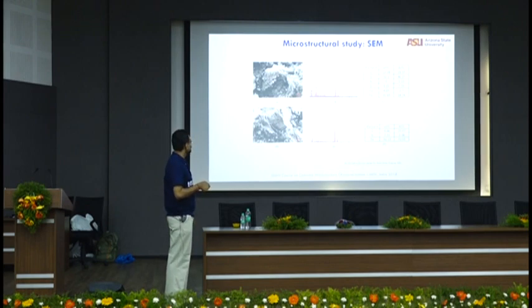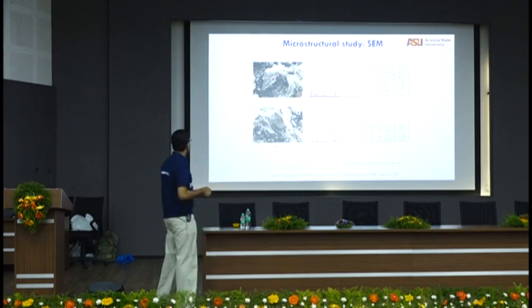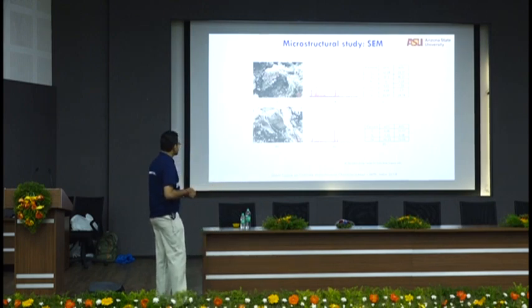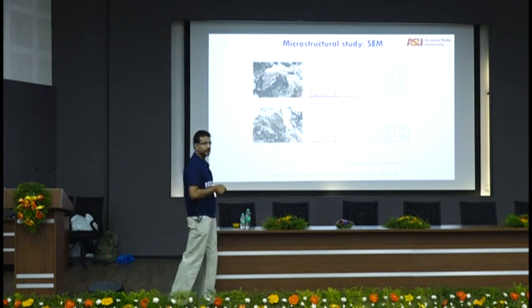So weight percent of carbon, oxygen, alumina, silica, calcium, iron. Carbon is because this was stuck on a carbon tape. So you have some carbon from that. And then that's a spot EDX. You see how different the value is. This is basically on an iron particle, and you see everything is iron. A little bit of silica, maybe some dissolved silica is there on the top of it. Very little, but you see mostly all peaks are iron peaks. And if you look at it, there's a little bit of silica, very small, but again, maximum weight percent of iron. Right?